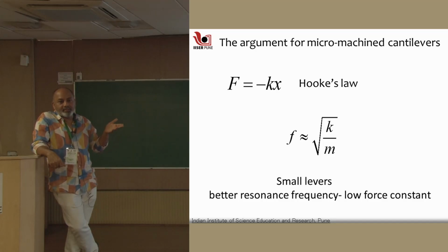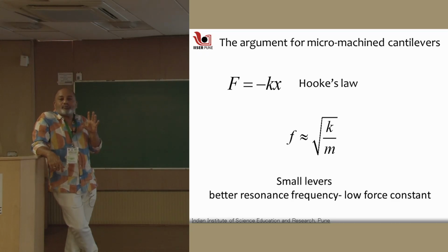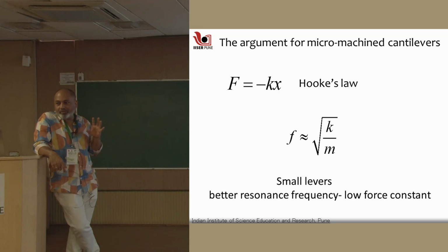If it has to move by a centimeter, then what is the force constant? It will be about, say, 0.1 Newton per meter, in that range, right? So roughly... no, not that. 10 raised to 6 Newton per meter or something, because you have a centimeter and 10. Right?